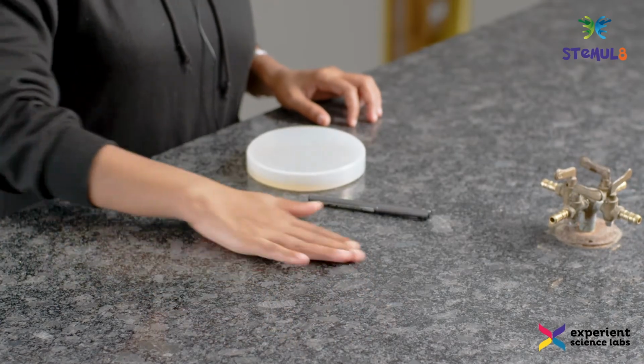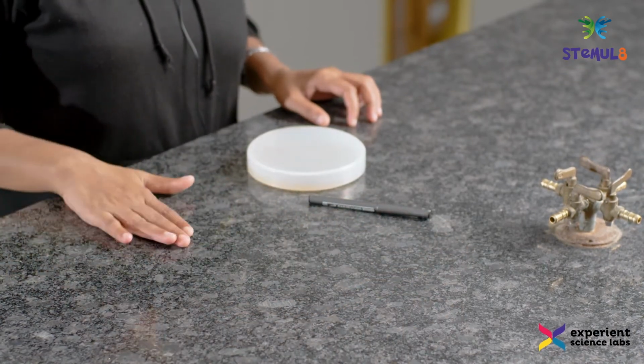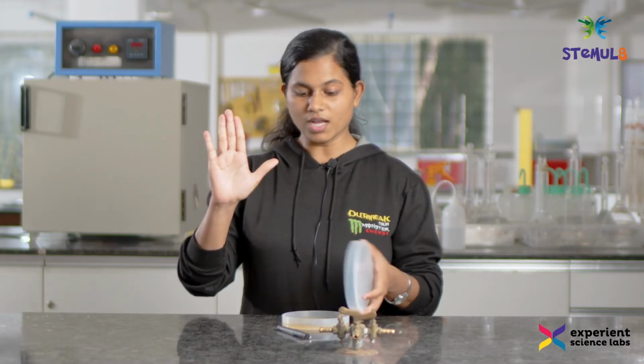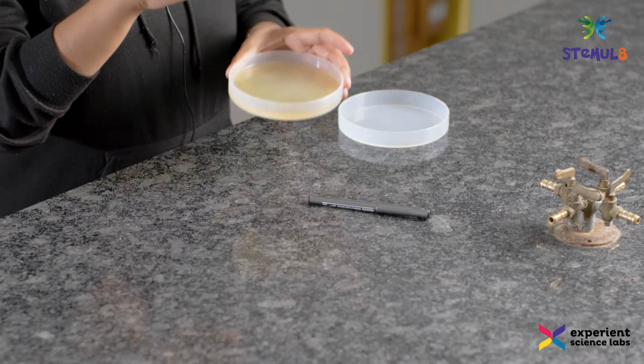Since bacteria is present all around us, I can just take a sample by rubbing my hand over this particular surface and get some sample for the bacterial culture. So, I am just wiping my palm, assuming that there were some bacteria present over this. Now my palm is sufficiently dirty and I am going to place this onto the nutrient medium.